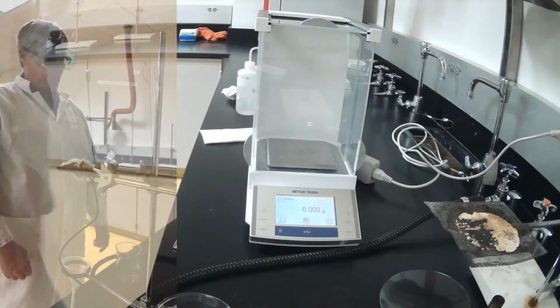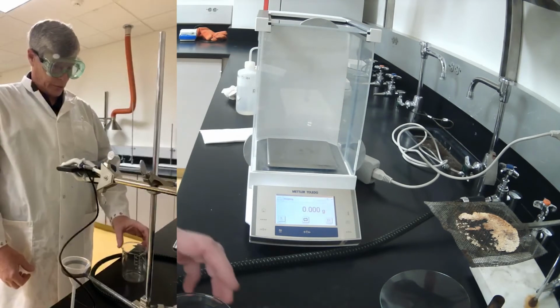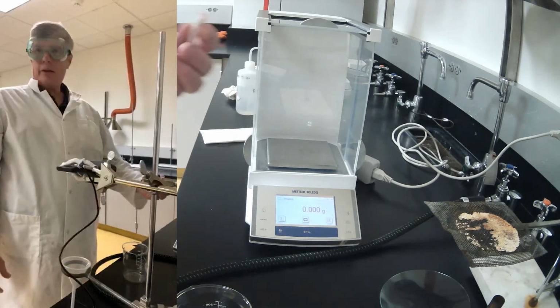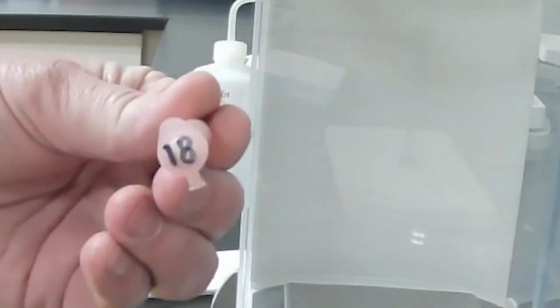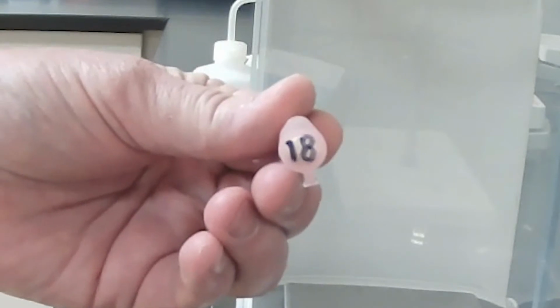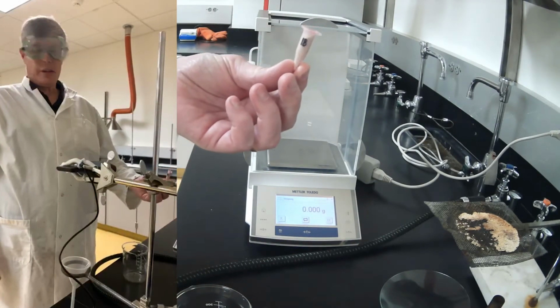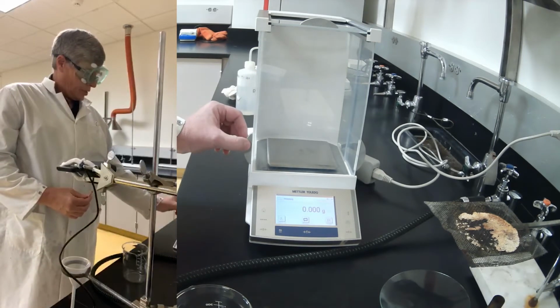Welcome, students. Today we are doing experiment 3, the separation of a mixture of compounds. The first thing you're going to do today is obtain an unknown vial and very carefully record the unknown number. This one happens to be number 18. Your grade will depend on how precise and accurate you are in obtaining the correct mixture ratio of the 3 compounds in this vial. So the first thing we do is some weighing.